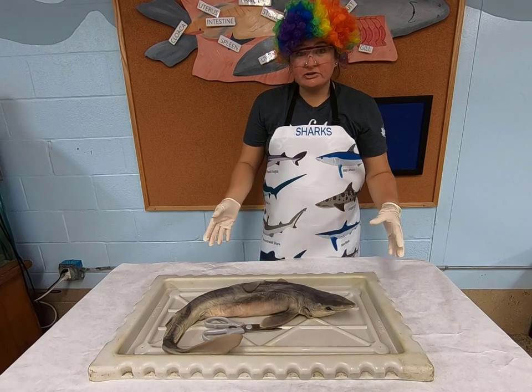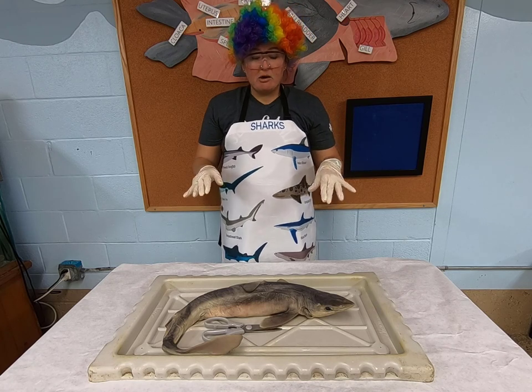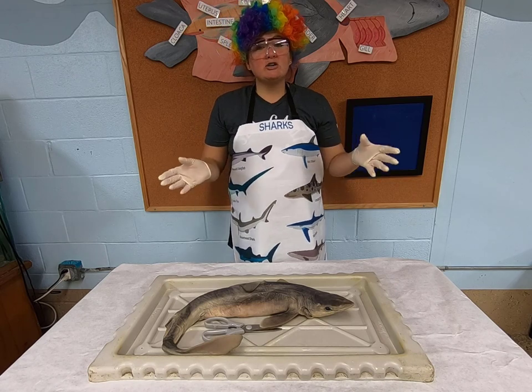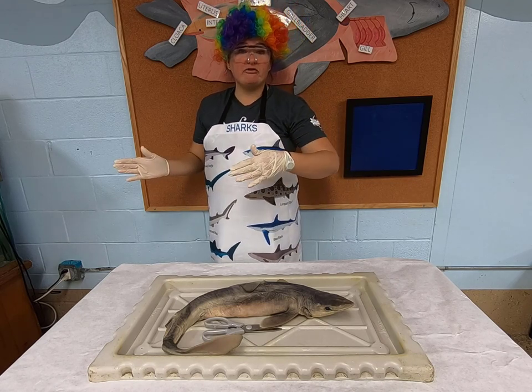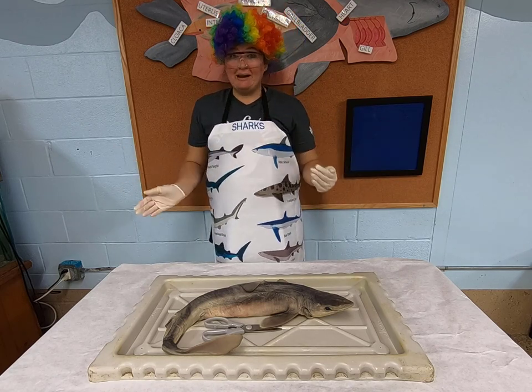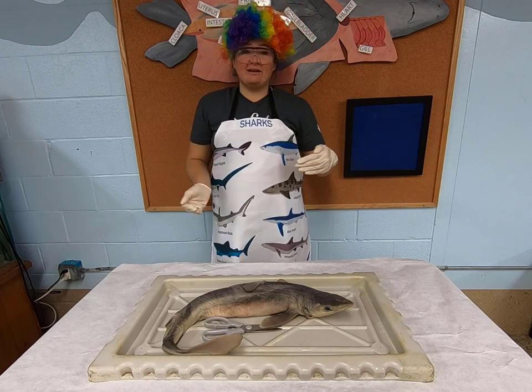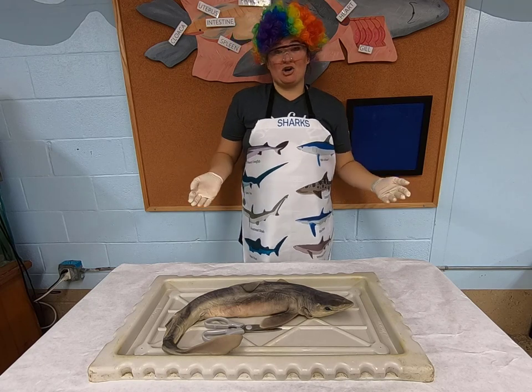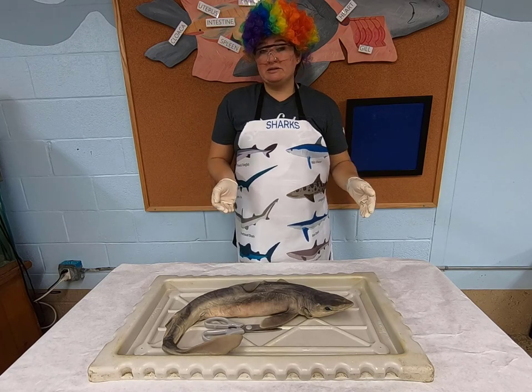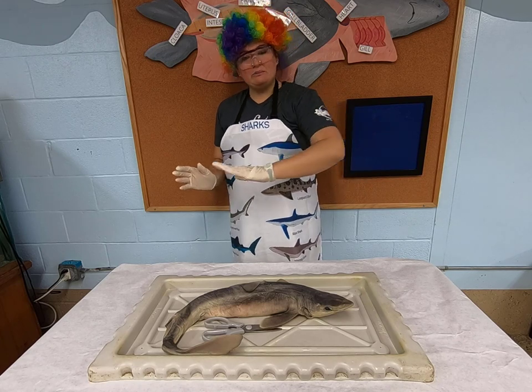So sharks also have these things called spiracles. Now, not all sharks have spiracles, but we say spiracles are miracles for sharks, and here's the reason why. Have you ever heard the myth that sharks need to keep moving their whole life or they can't breathe? So they need to keep swimming, or they can't breathe. Not all sharks have to do that. That mode of breathing is called ram ventilation. So sharks like your great white shark, they're gonna have ram ventilation. They're gonna have to kind of keep some sort of flow of water over their gills. They can kind of chill out in the currents and slowly go, but they will have to keep continually moving.